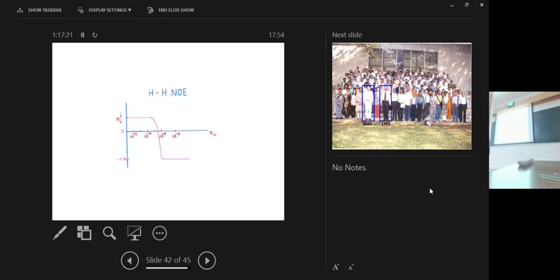Correlation time is the rate at which the molecule tumbles, how fast it tumbles. Nanosecond time scale, microsecond time scale, or picosecond time scales. Depending upon the time scales of the motions of the molecules, if the molecule is big, it is very sluggish. It cannot move too fast. If it is very small, very rapid movement. Here are molecules which are very small, here are molecules which are very big. And you see the NOEs can have positive or negative signal depending upon whether it is a small molecule or a big molecule. But when you are talking about proteins, we are mostly talking in this domain. This becomes an extremely useful technique for structural biology.